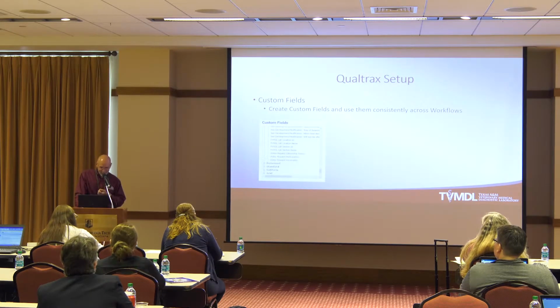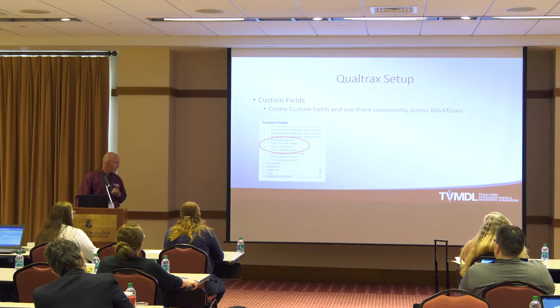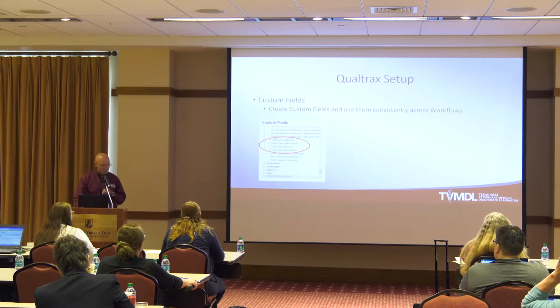You got a second. Okay, so we've created these custom fields. So for us, we have the laboratory location ID: College Station, Amarillo, Center, Gonzales. We have the lab sections: necropsy, analytical chemistry, toxicology.